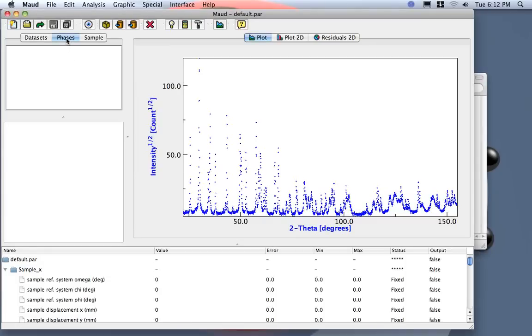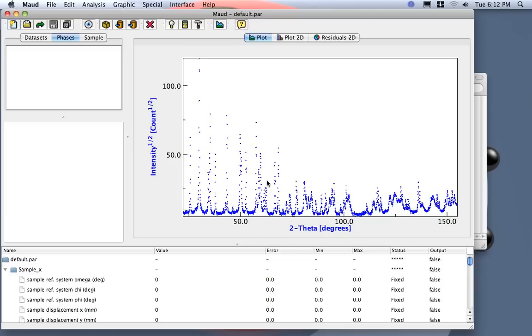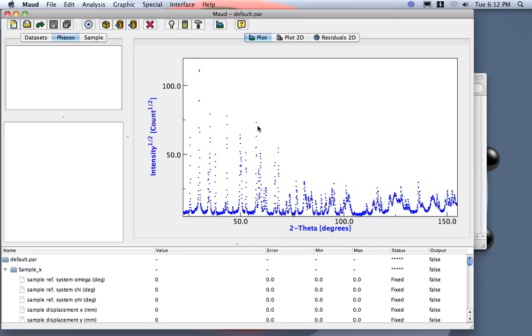Actually, we need now to load the phases that are contained in this sample. I recall the sample was containing corundum and zirconia stabilized with ceria. If you don't know what you have inside, you should use other programs to do a search match to identify the phases inside. Or, if you start with an ab initio, then you can define and look for the phase yourself. This will be probably in another tutorial.